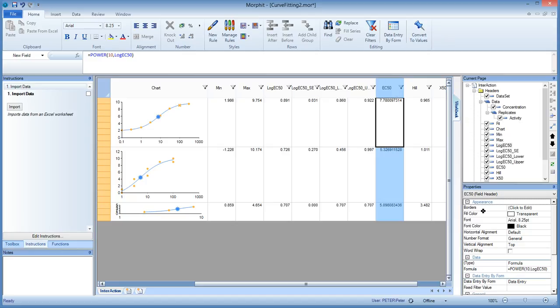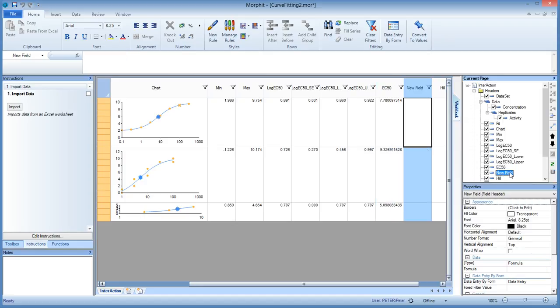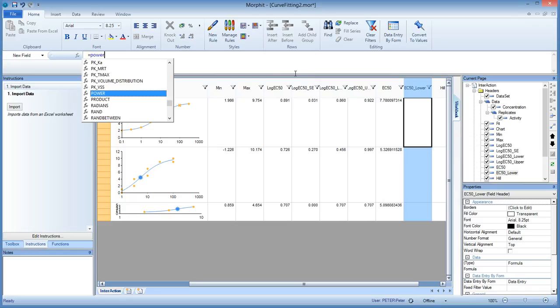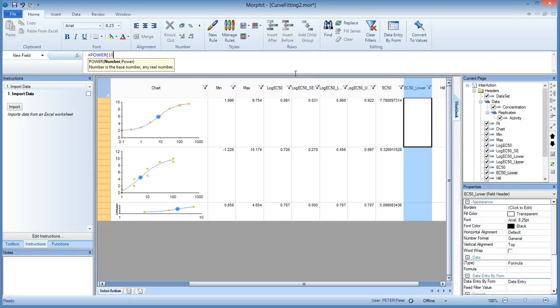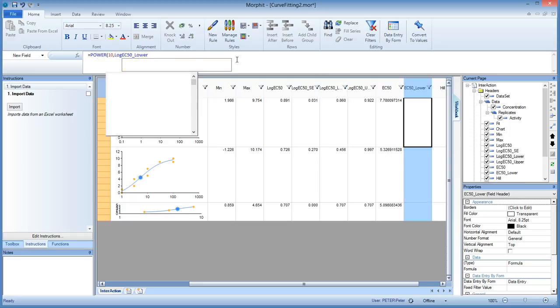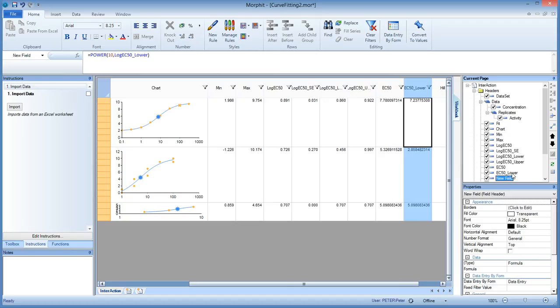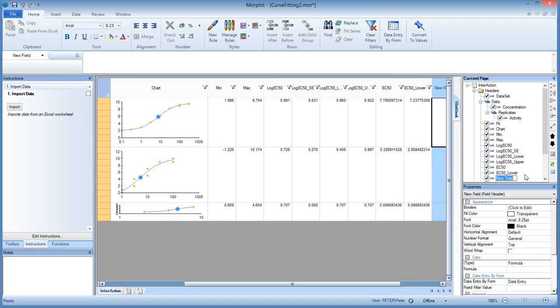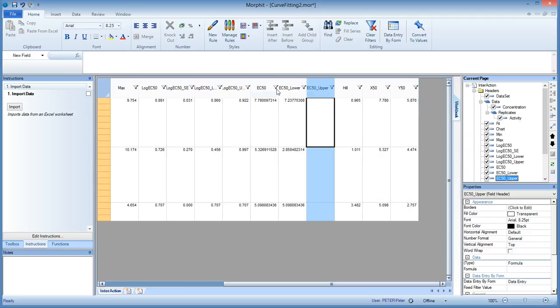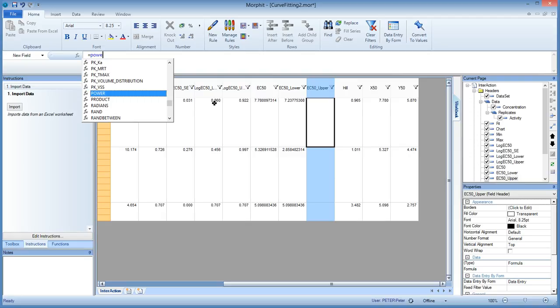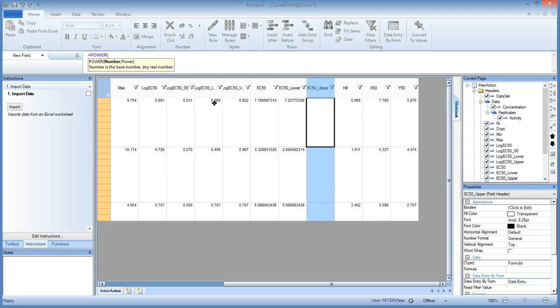And we can do the same for the lower and the upper range. So let's do the EC, let's call this the low, the EC50 lower. And that is done. Is power 10. And then we take the lower here, log EC50 lower. And then we do the same. It's quite a lot of work, although it's all pretty straightforward.